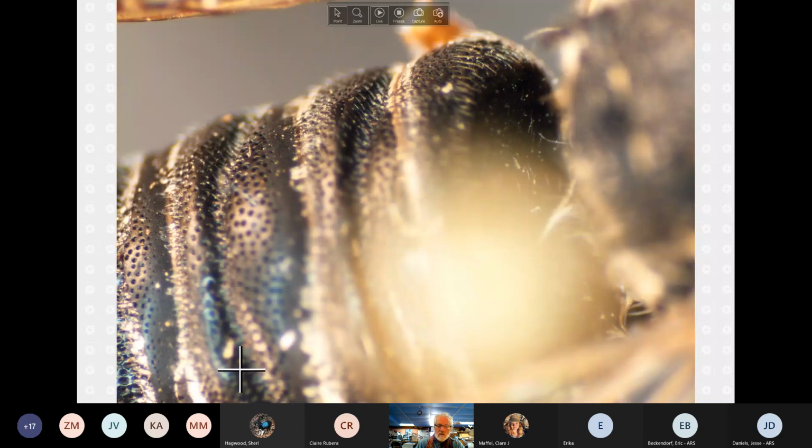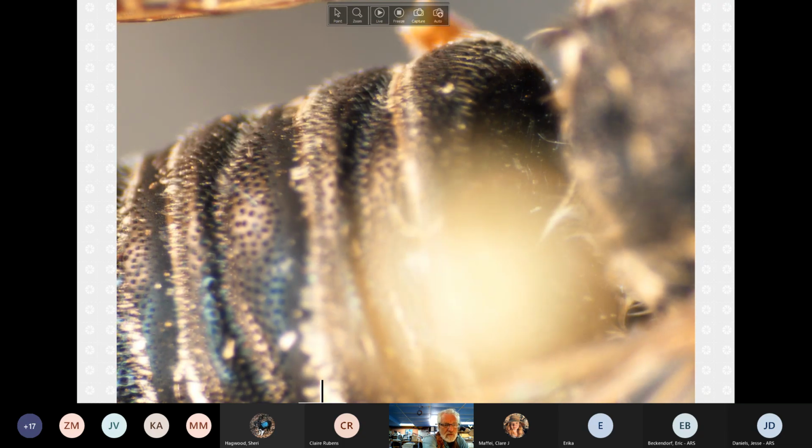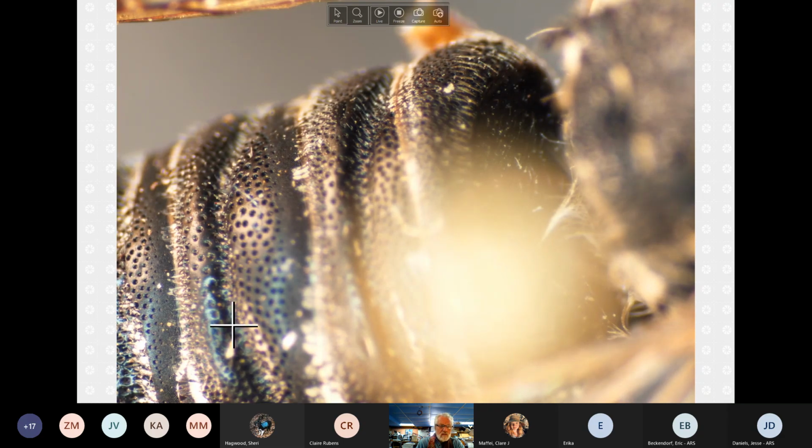And as we get towards the middle, I'm going to put this in focus, but you can see that this trough, this groove with pits really goes the entire way and is basically unchanged during that path. In other words, it doesn't become shallow or anything. Now, it's more or less in focus there in the middle. And you can see it'd be hard to say that this central area is any different from this other area. That's the difference.